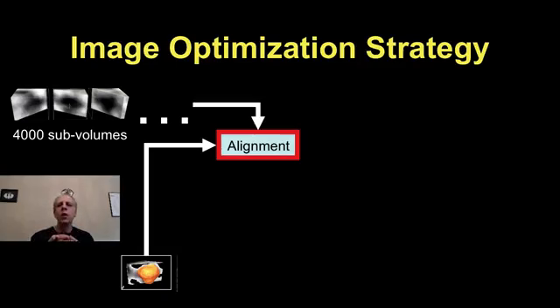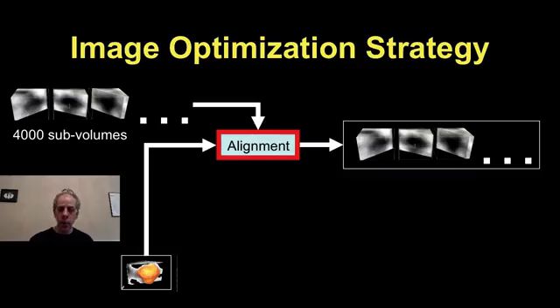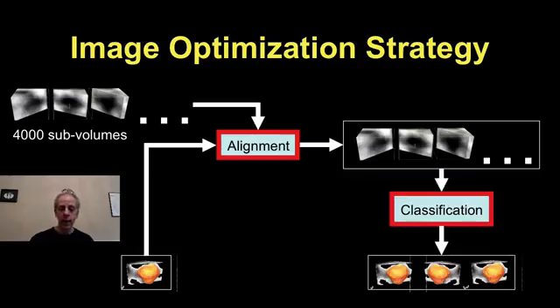You can actually, if you want, align only those where you put a very, very high threshold and very high level of confidence in the alignment. You say, I'm going to keep only those that, after I align, the distance is almost zero. They're almost identical. So then I have more confidence that I have done a good alignment. Once again, alignment is you start and just rotate them until the distance that we showed in the previous slides becomes the smallest possible. Once you have them aligned, then classification becomes a bit easier.